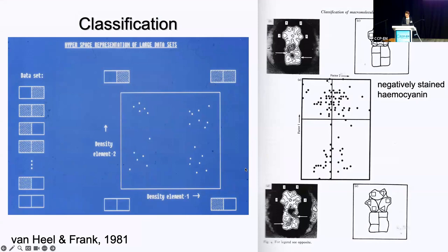So that's quite nice. You could do a 2D plot and you can see there are clusters, different patterns that come out. Now, your images nowadays might have 1 million pixels, so you'd have to have a 1 million dimensional plot. That's harder to show in a slide, but the idea is the same. You have a multi-dimensional plot that shows you where your different clusters of images might land.